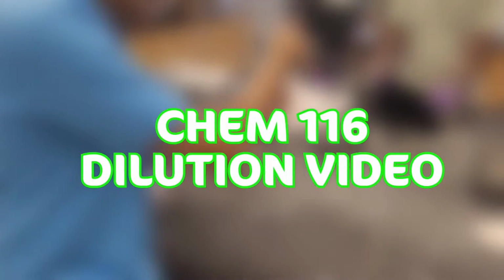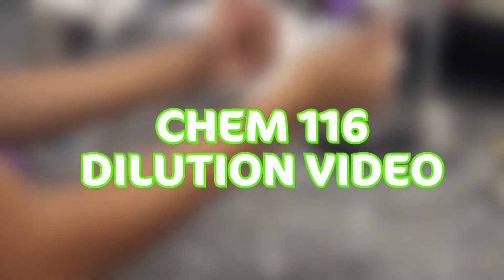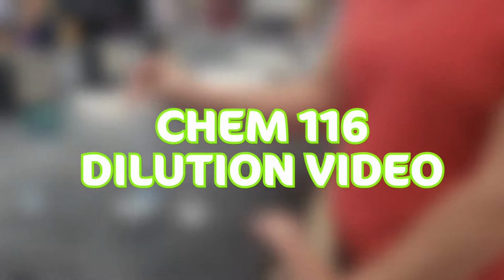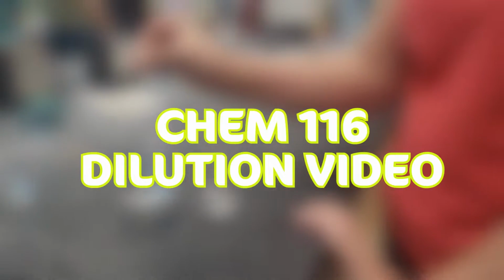Hello, and welcome to the dilution video for Chemistry 116. In this video, we will be defining the meniscus, comparing the stock solution as well as the diluted solution, as well as displaying the technique utilized to dilute a stock solution.